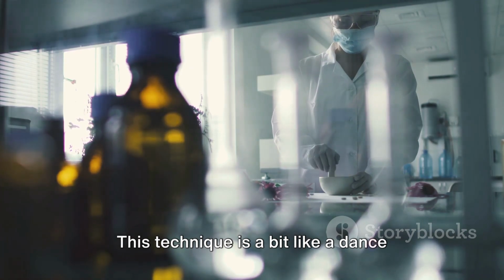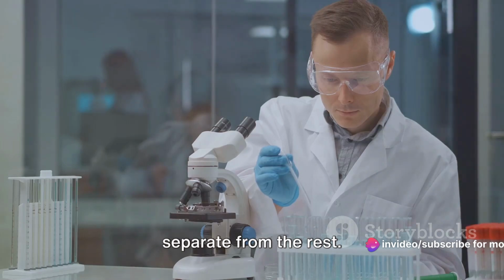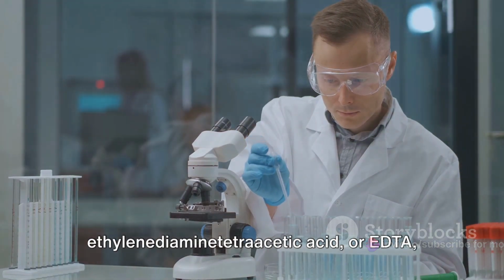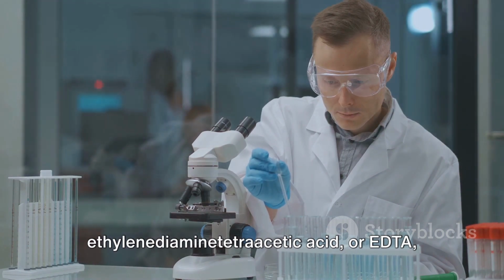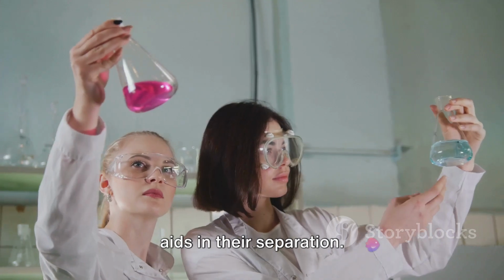Now, let's move on to complexation. This technique is a bit like a dance, where two molecules form a complex and separate from the rest. A classic example is the use of ethylenediaminetetraacetic acid, or EDTA, which forms a complex with metal ions and aids in their separation.